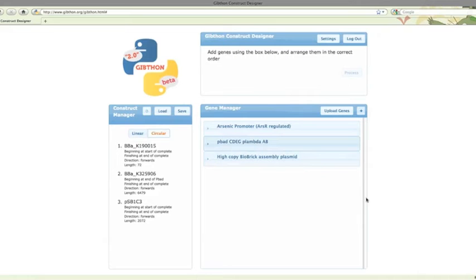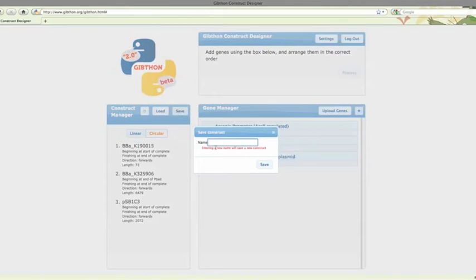All we need to do now is save, and then we can progress. Hit save, enter a name. OK.